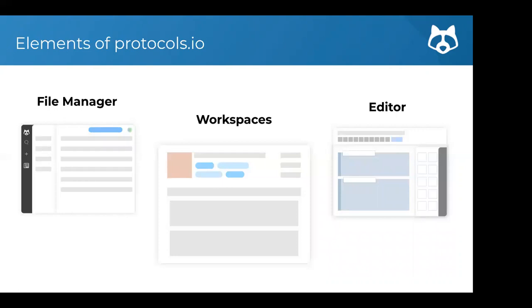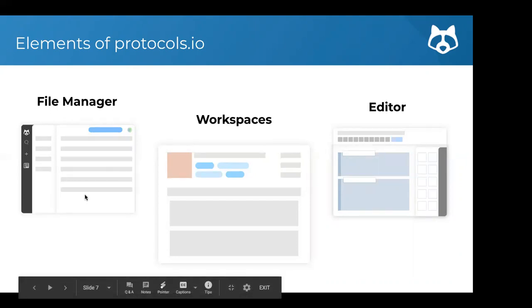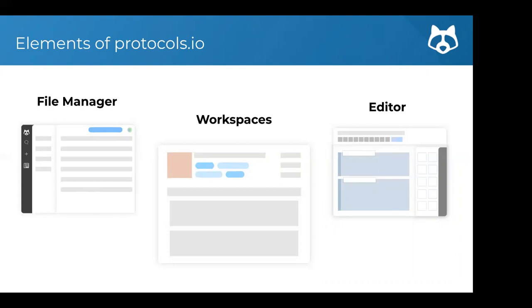The protocols.io platform is really structured around three main parts. One is our file manager — this is where all your files and protocols are stored and where everything happens. Next are workspaces — if you're collaborating with others, you'll do that through workspaces. And then there's our editor — when you're creating protocols, you'll do that through the editor. Today I want to quickly touch on all three of these elements.